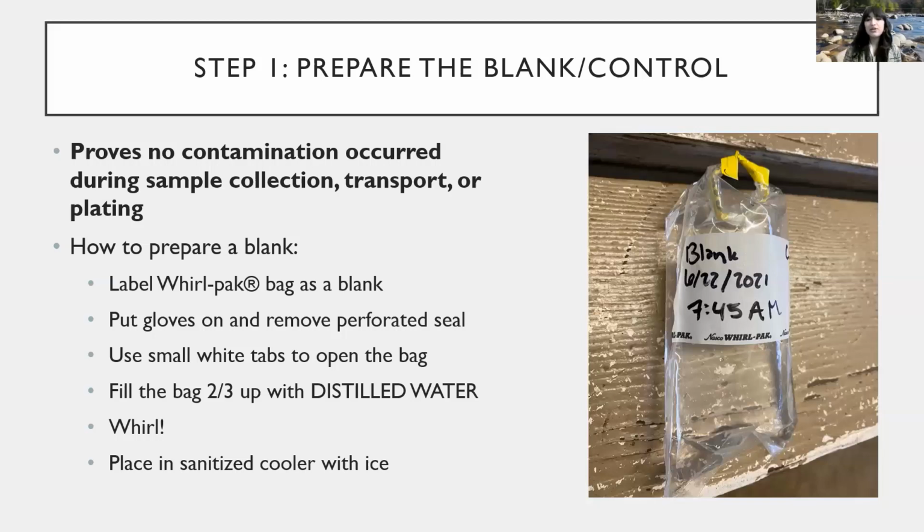You're going to use a Whirlpack bag. These bags are sterilized, and they're what we use to collect our water sample for bacterial monitoring. You can write on them. So with a permanent marker, you can label the bag with the word blank on it, the date, and then the time that you're preparing this. You can see here on the photo on the right an example of that.